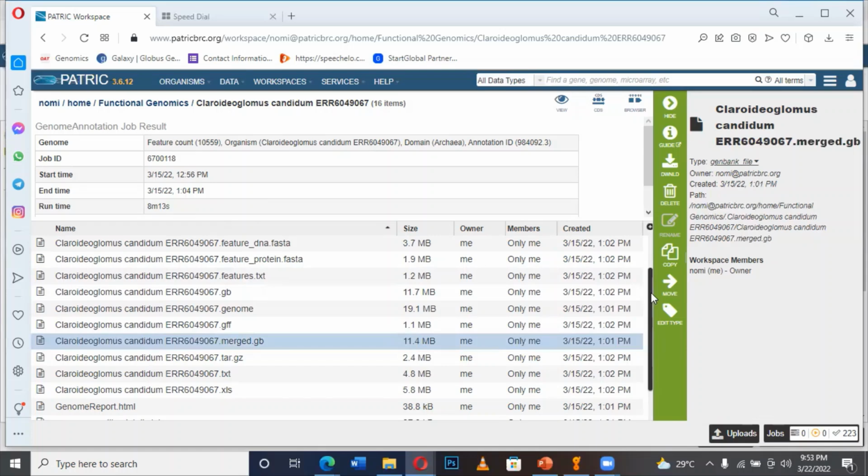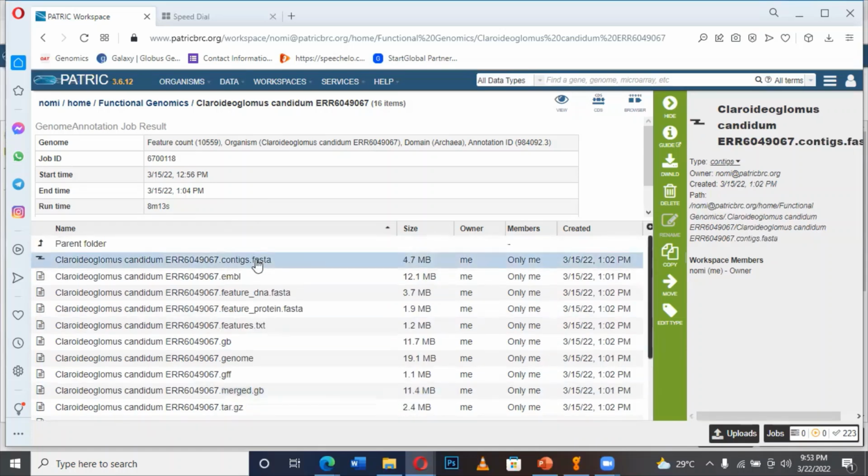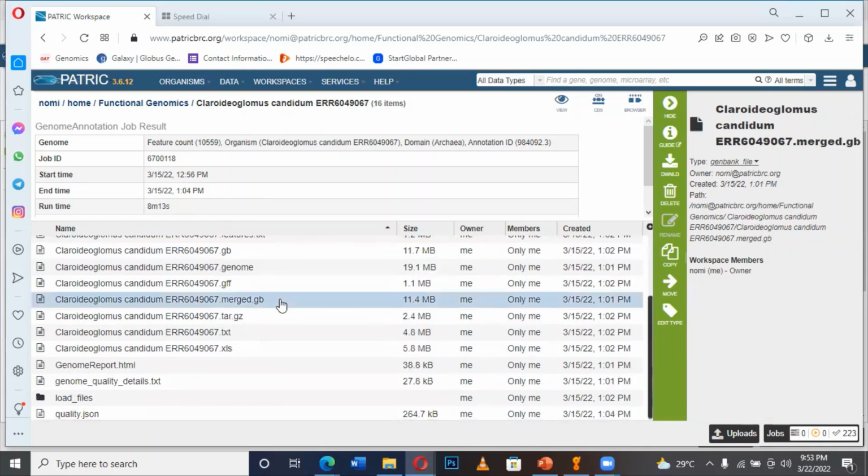So the contig.fasta file that we submitted for genome assembly, the result we get for genome assembly, which is the contig.fasta, we have the contigs, and so many of them were segmented like in fragments. So the sequences in the file of the genome are in fragments. That's what I mean. But here it's no longer fragmented, all contigs have been merged as a whole genome.